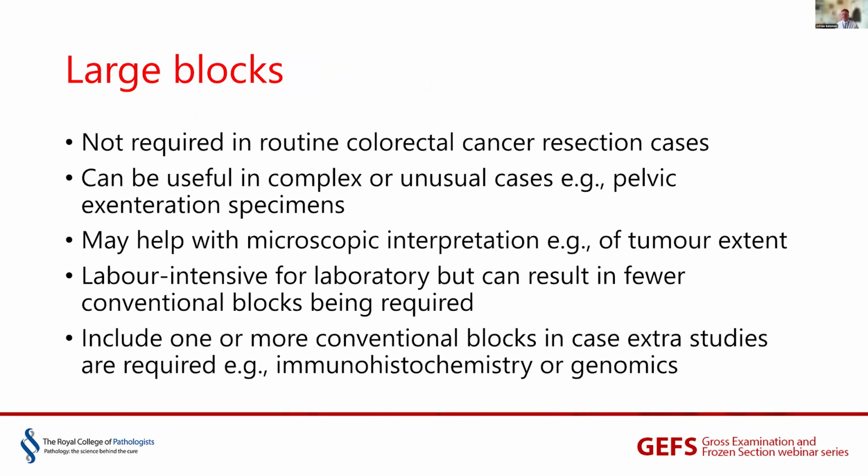They're quite labour intensive for the labs to prepare, but they can be useful in complex cases. We do a reasonable amount of pelvic exenteration surgery here in Southampton. That might be for locally advanced and/or recurrent colorectal cancer, or for other sorts of cancer such as gynecological cancer, sarcomas, and urological tumours. They can be useful for helping to sort out the position of the tumour within a relatively complicated anatomical situation, and they can, in that situation, save quite a lot more small blocks being prepared.